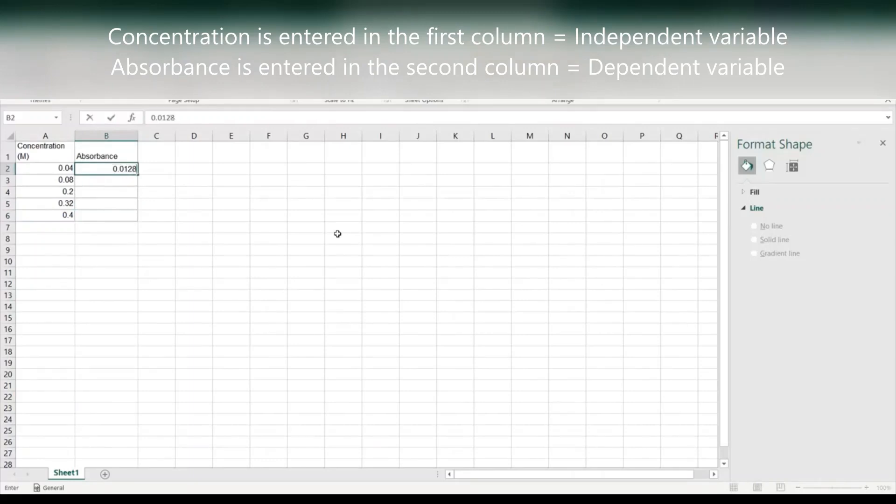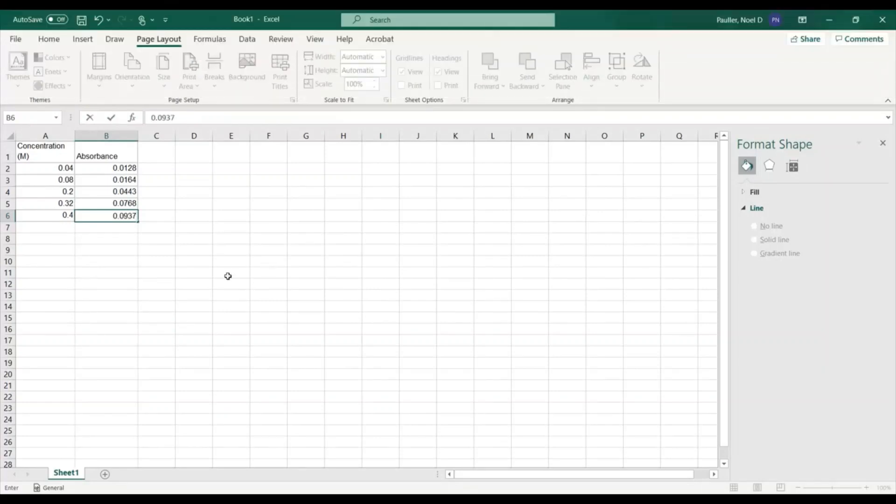I'll put concentration in the first column. That's the independent variable. I'll put absorbance in the second column. That's where I want the dependent variable. Once I have the data entered I can go about creating my graph.